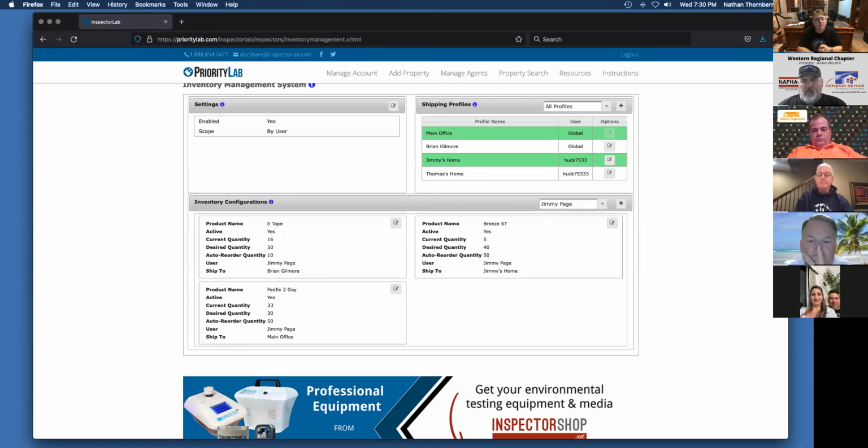At the end of the day, there was another guy, I don't think he's on the call, Jerry Suarez, who next week gave me a good idea. I don't know when the last time is that you updated your Priority Lab app, but if it doesn't automatically default to 15 liters per minute and 10 minutes on the IAQ cassettes, then you need to update and get the latest version, because that's pretty much what people are putting in 99% of the time. Just a silly, easy idea. If you got one, send it to me. We will implement it for you and for all of your friends.